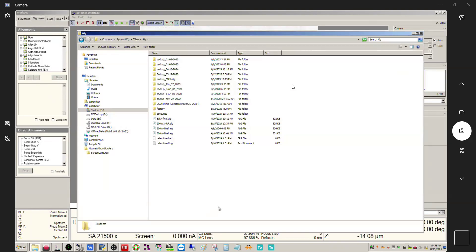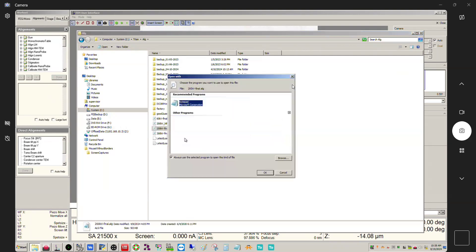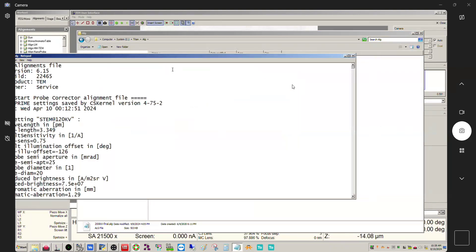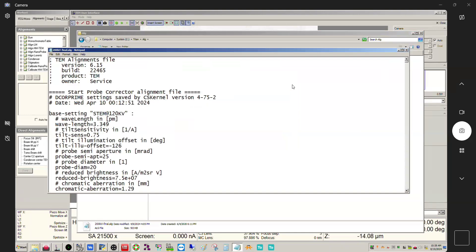Let's take a look at what's in one of these files. If we want to look at this guy for instance, you can right click, open with, uncheck this, but you want to open it as just a notepad document and you can see what's in here. It tells you the owner and everything.